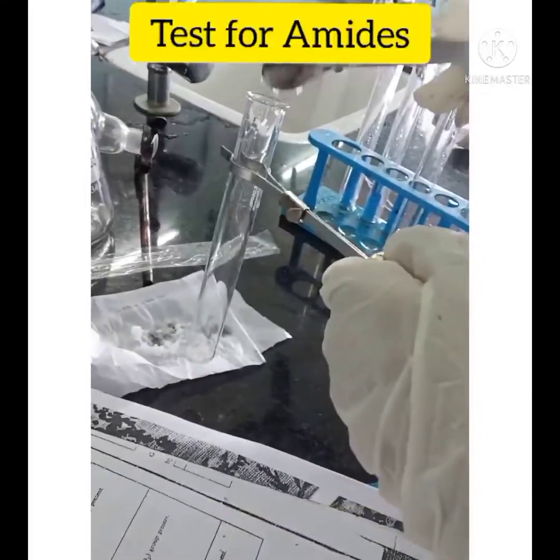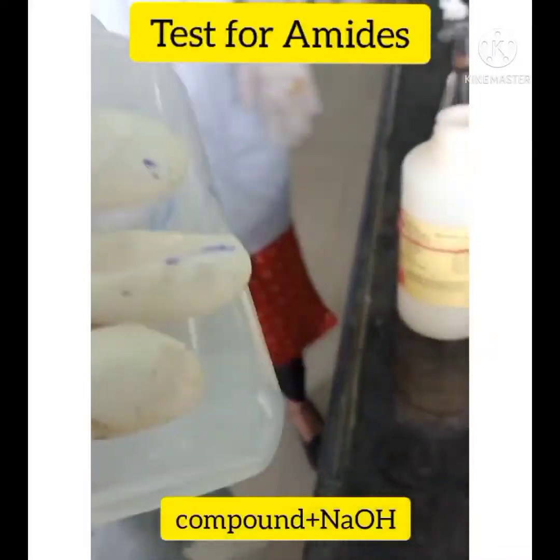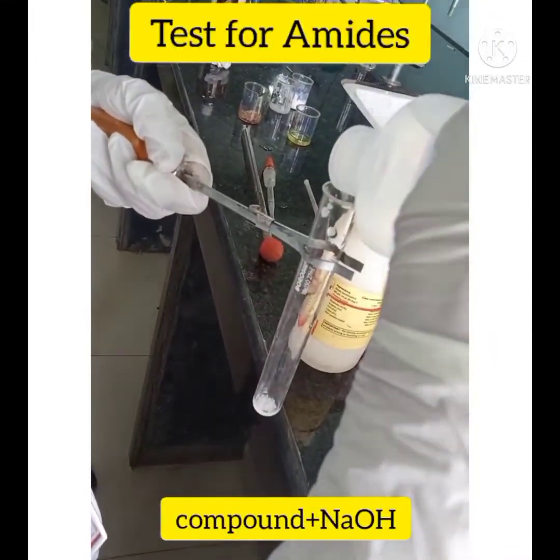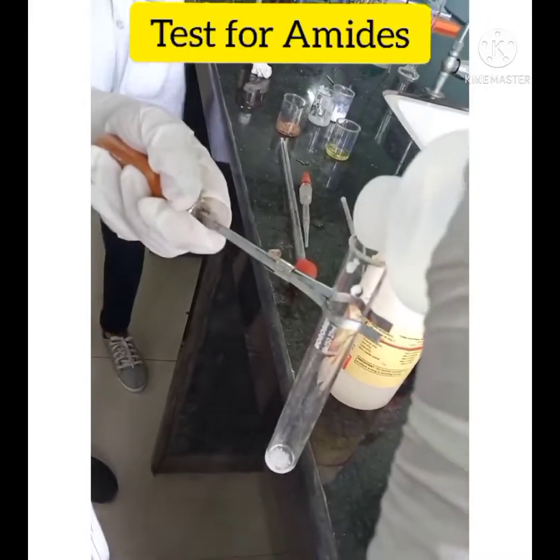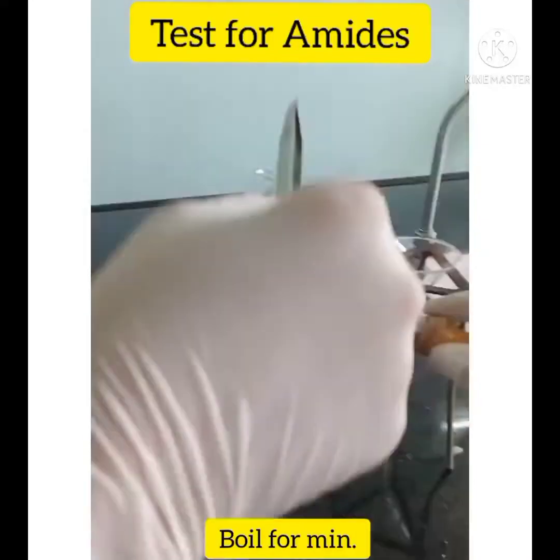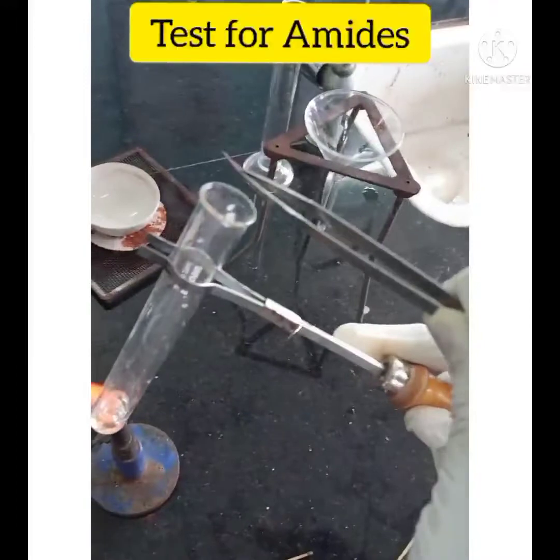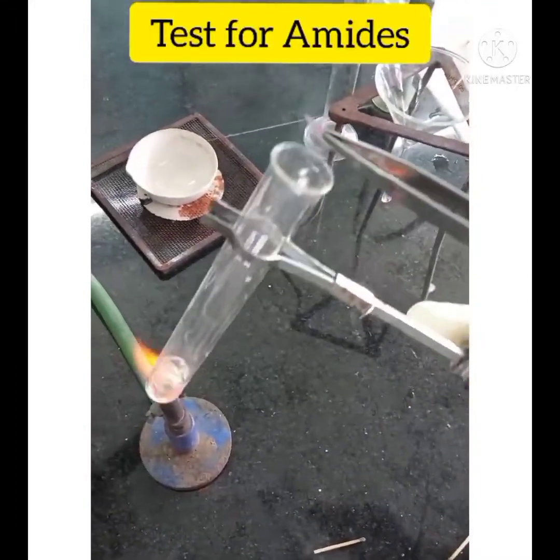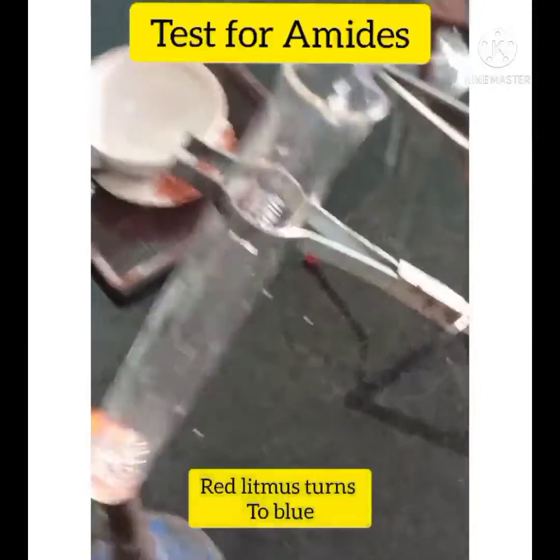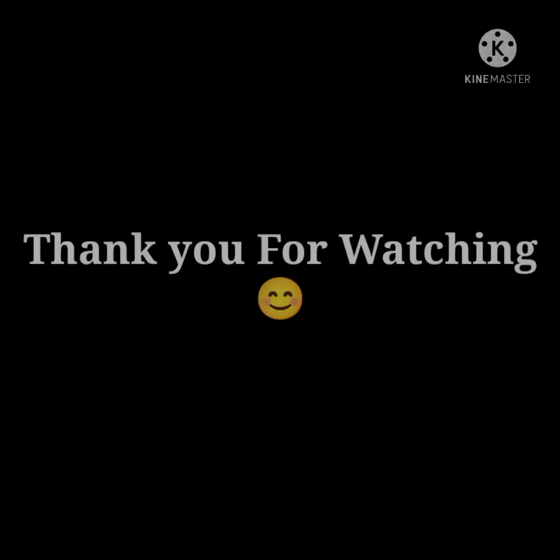The test for amide: in this test, take 0.01 gram of compound and 20% NaOH solution. Boil for 1 to 2 minutes. Take a piece of litmus paper and place it over the test tube. The litmus paper changes from red to blue.